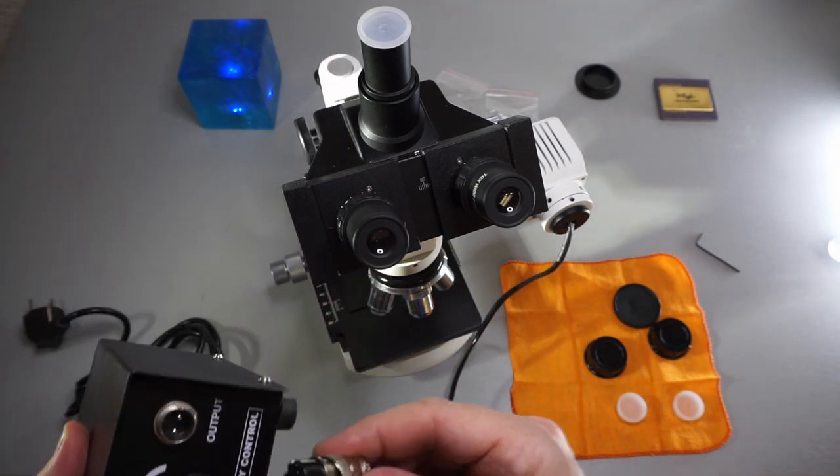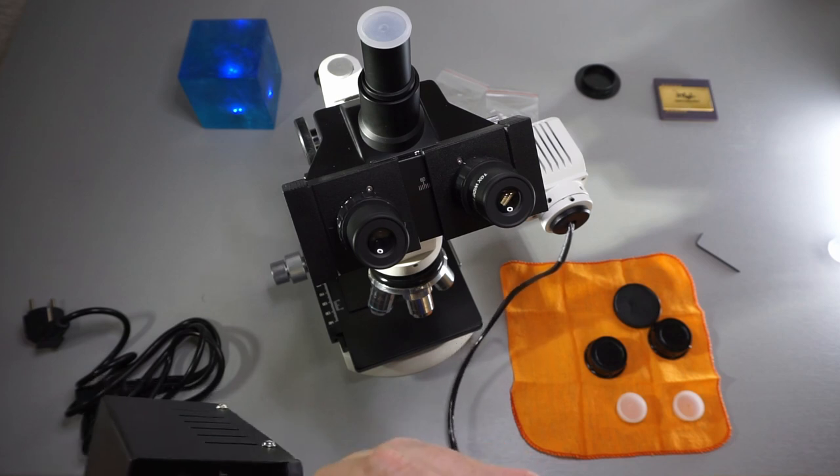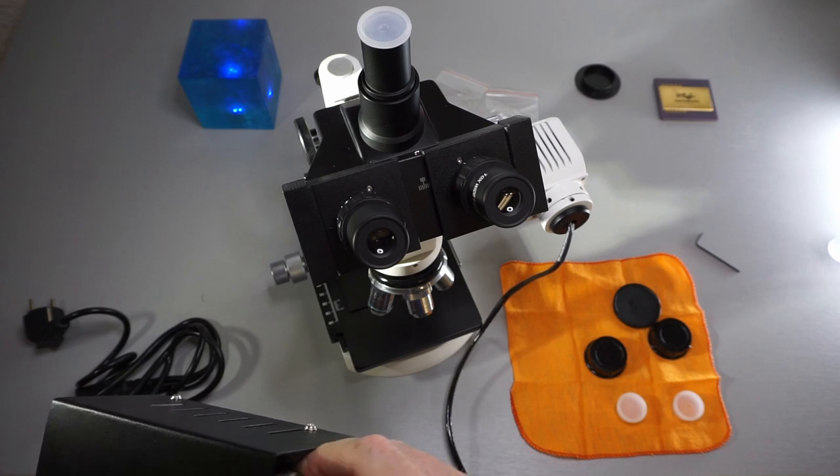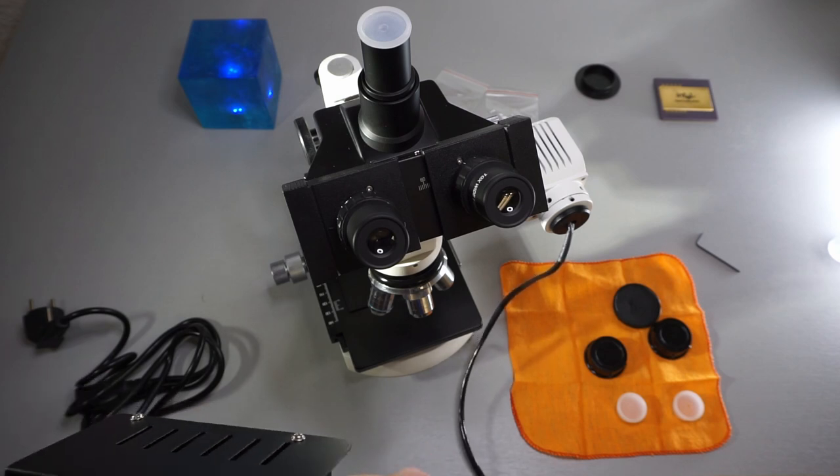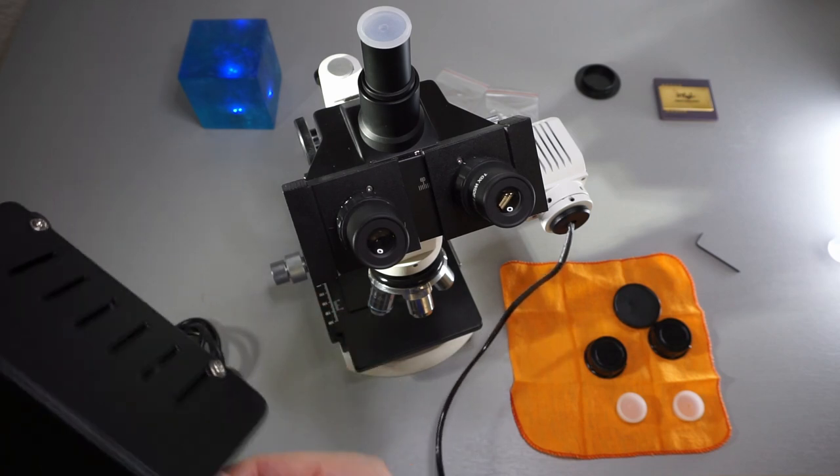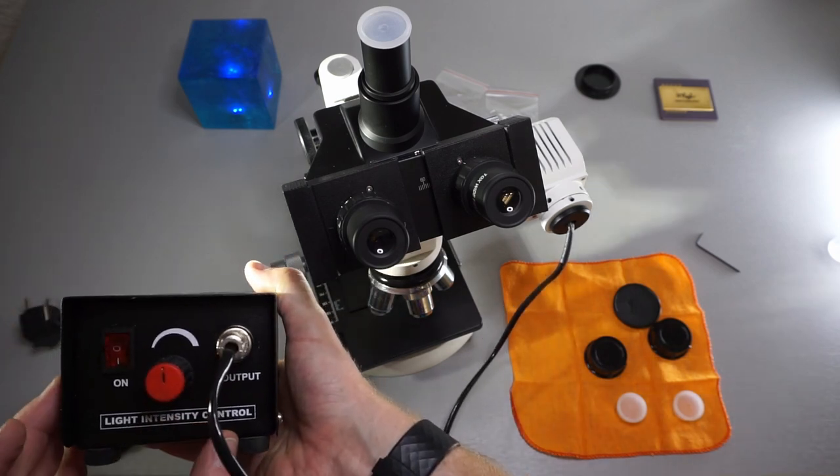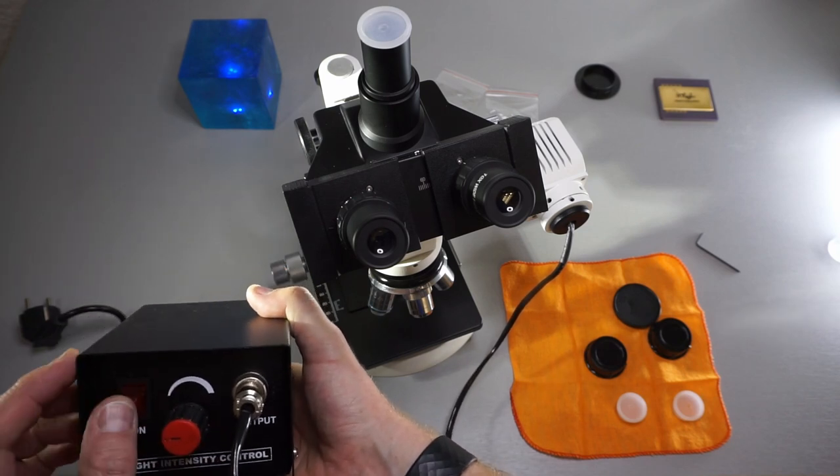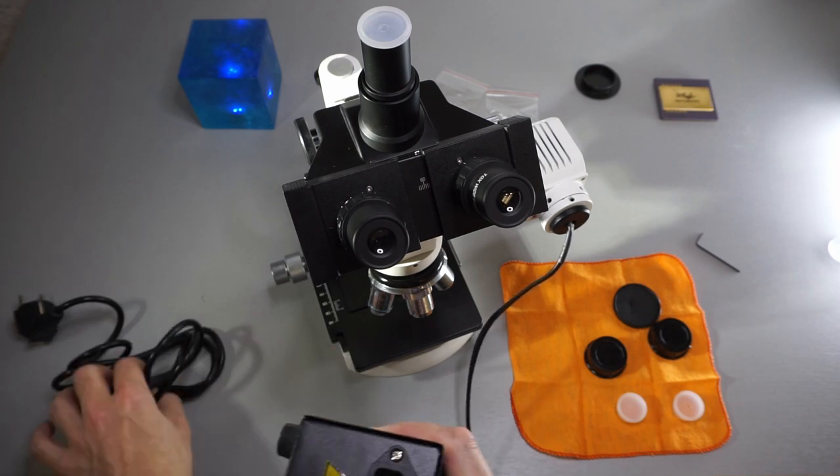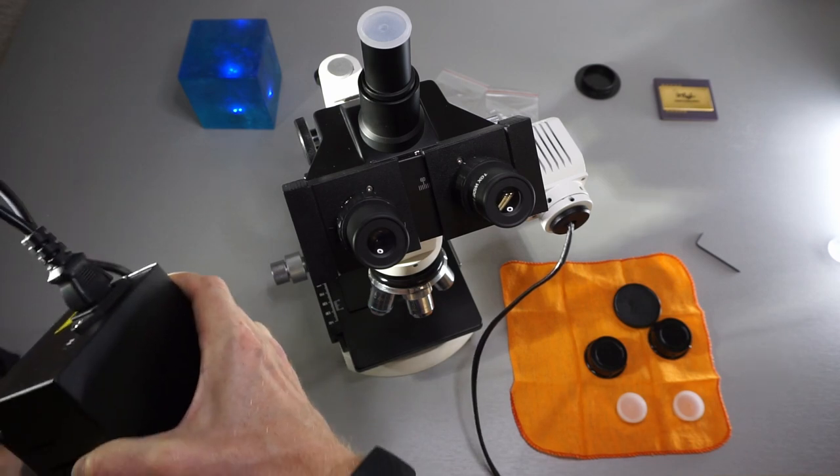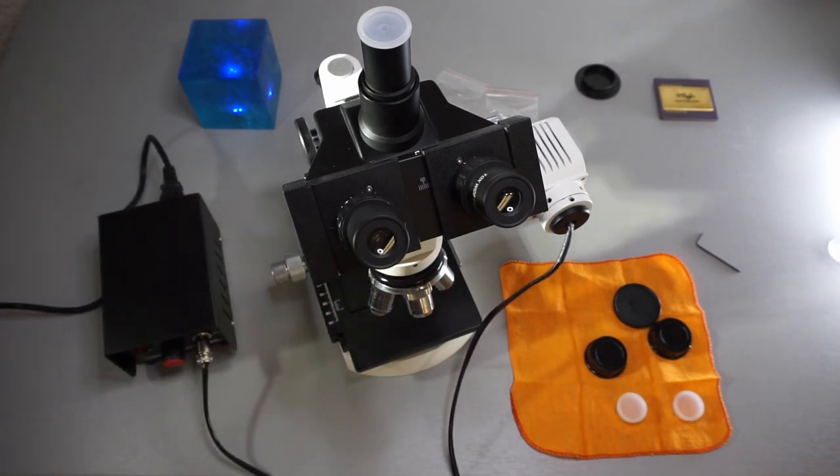This is connected to the power source. This looks a little bit old-fashioned, I have to say, but probably it works. I'm just screwing this into here. You can regulate the light intensity with this knob. Switch it off, there's power access. Let's maybe try it out immediately. Yeah, there's some light visible. So that works.